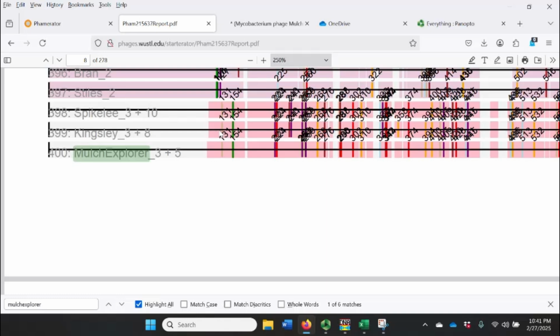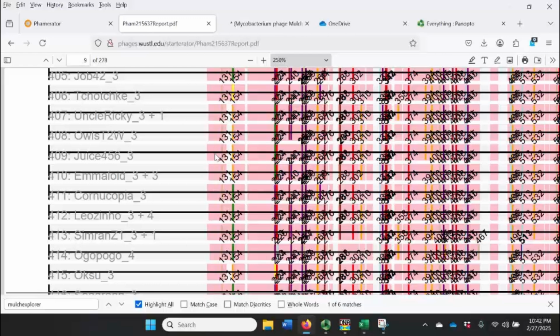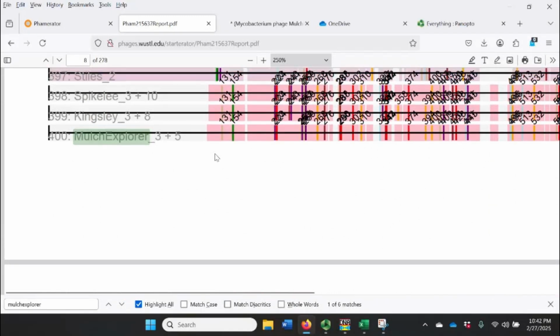Human consensus means that humans have agreed on a particular start site, have selected a particular start site consistently, whereas biological conservation means that your start site is present either across the fam or at least across the members of the fam that are from genomes in the same subcluster. In this particular case, we have basically 100% conservation for the genes in this fam in genomes in this subcluster, so that's not going to help us to distinguish between start sites.